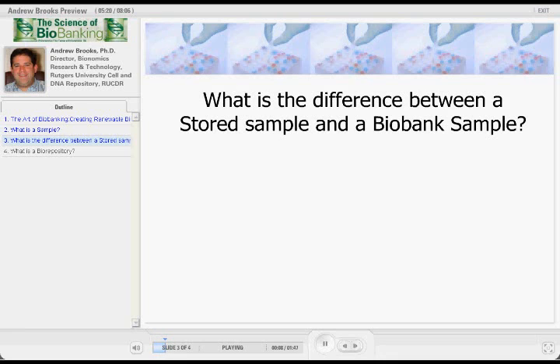One of the things I'd like to point out is really what the difference between, in my opinion, a stored sample and a biobank sample is. So a stored sample is somebody that gives you something and you hold on to it, and at some point in time they come to you and say, I'd like that back, and you say, okay, here you go. And they'd say, well, what did you do with the sample during that time? And you said, absolutely nothing. You told me to keep it here, and that's where it is. You need to be able to find that sample. You need to be able to demonstrate that for the lifetime that you had that sample, it was where it was supposed to be, i.e. at the right temperature and the right condition.